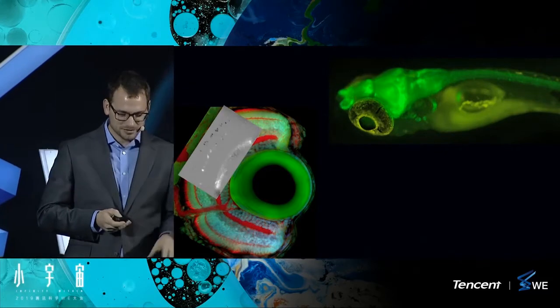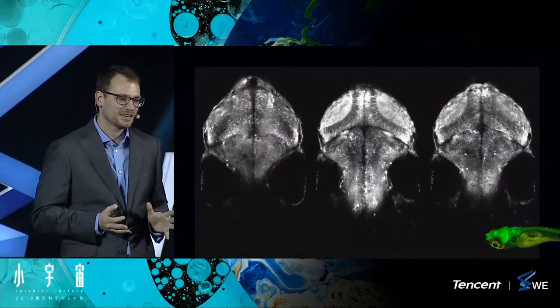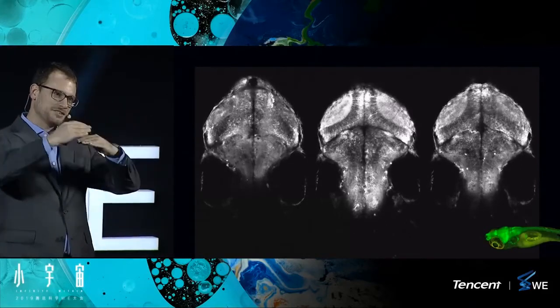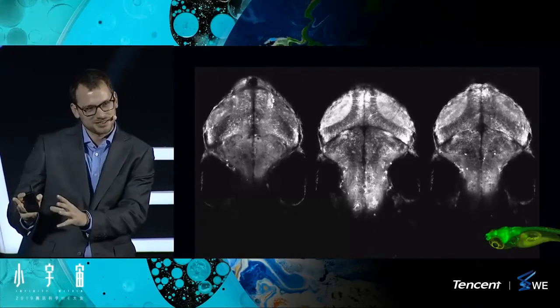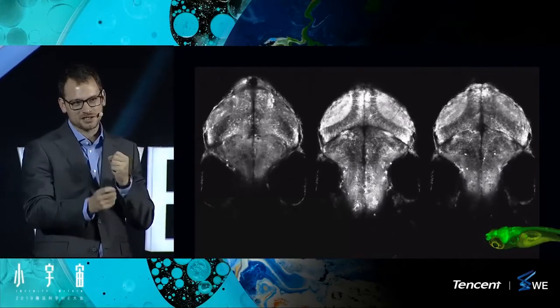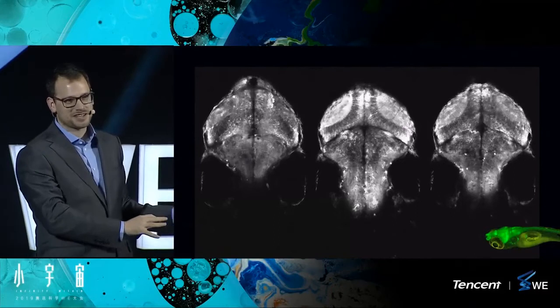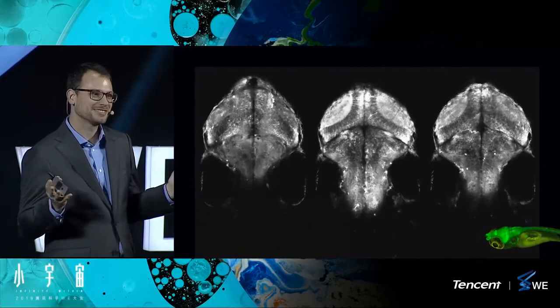Now, we can do these kind of experiments in the eye. We can also do them in the brain. And this is what it would look like if we did a similar kind of experiment with a very expensive microscope, where we take 3 different slices, optical sections, through the live brain of the fish. We present the same stimulus, and again we see some neurons switching on, switching off in relation to the light, plus we see a huge number of neurons doing something completely else. This should not surprise us. This fish is alive, it's presumably thinking, it's presumably planning.